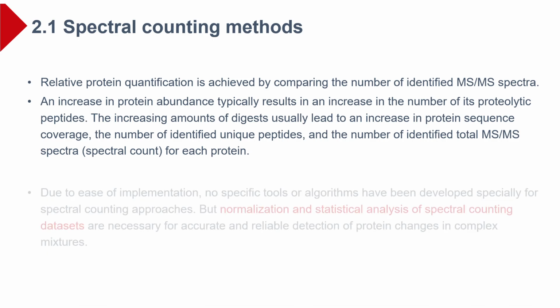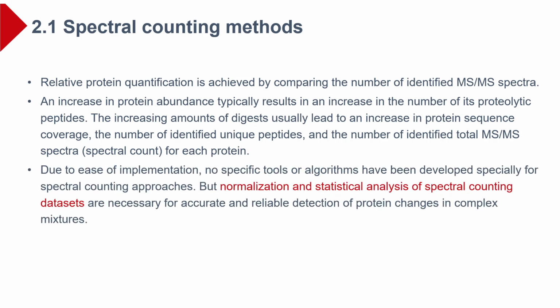Due to ease of implementation, no specific tools or algorithms have been developed specially for spectral counting approaches. But normalization and statistical analysis of spectral counting datasets are necessary for accurate and reliable detection of protein changes in complex mixtures.